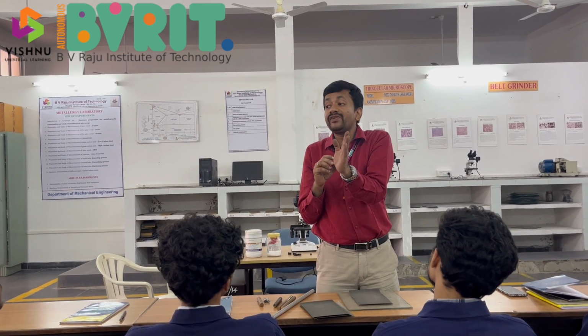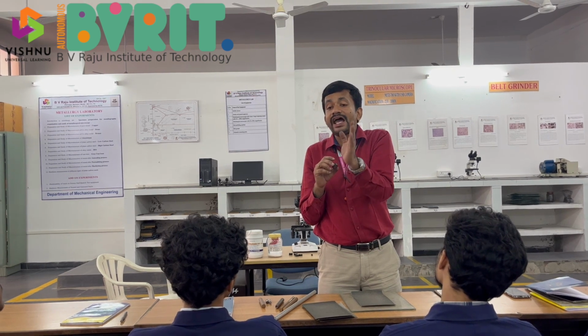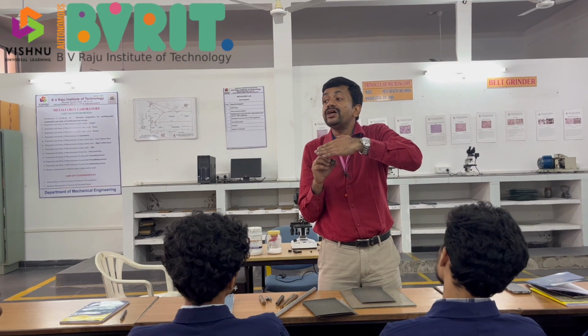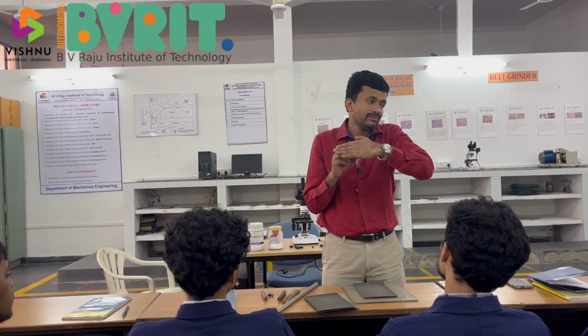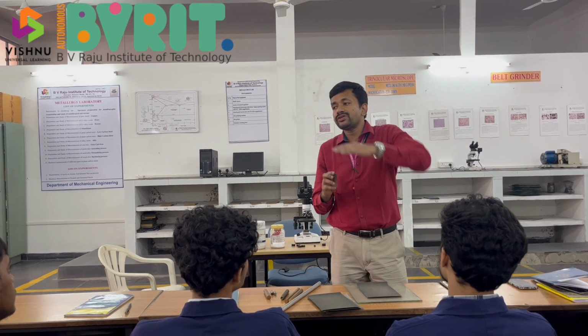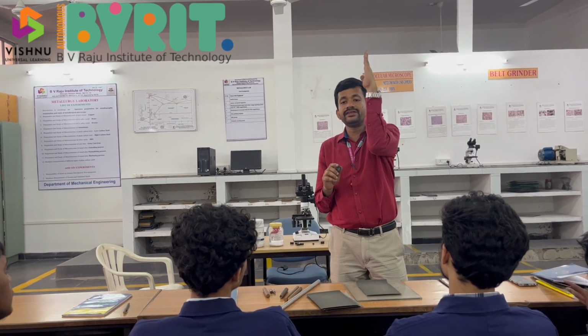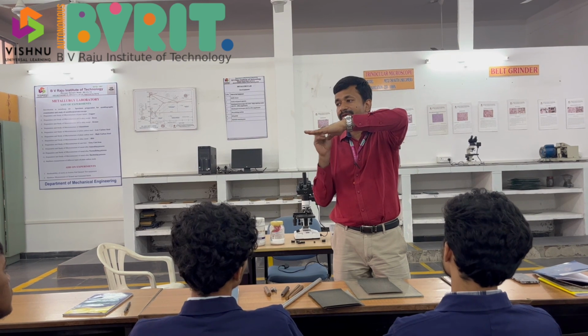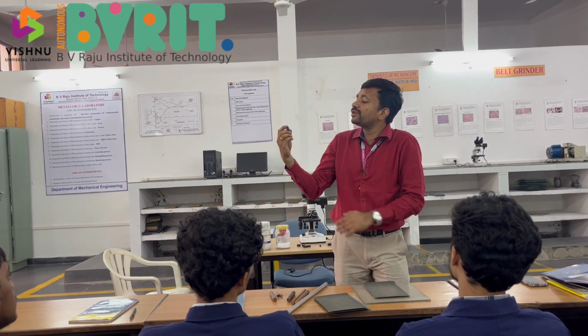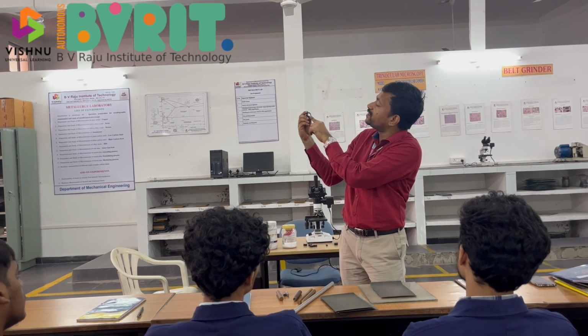Next paper when I am using, only then I will change again to parallel and I will move perpendicular to that direction. Okay, understood everybody? So suppose all my scratches are like this, or let's say like this. What I'll do? I'll move it this way. I'll orient and then I hold. I'll see where my scratches are. Now I can see all the scratches are like upward.